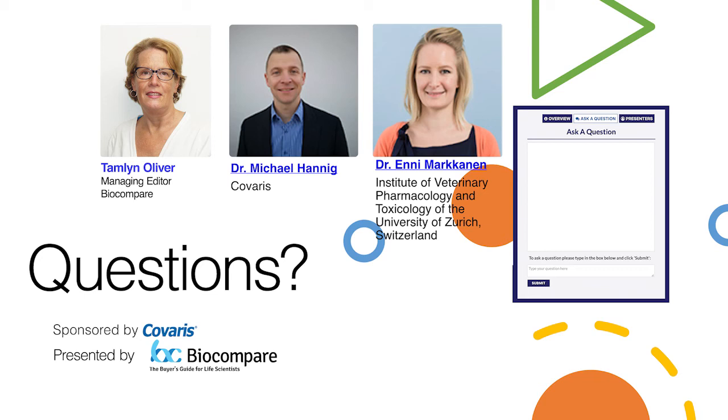In others, you really have to go and pick together tiny pieces from here and there, and it's just much more work intense and takes much longer. So we never really measured any of the surface area, if you want, that we isolate. But as I showed you with this adenoma sample, these are tiny pieces that you can isolate from 2 consecutive sections. In that case, most of the time, you really get enough RNA out for the specialized workflow afterwards for sequencing of under 10 nanograms of RNA.